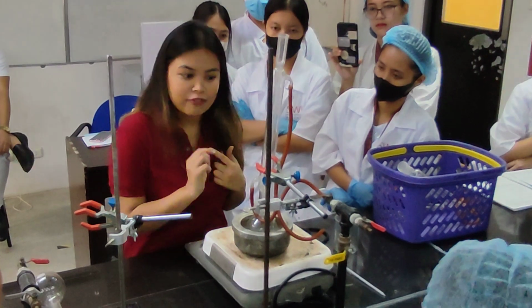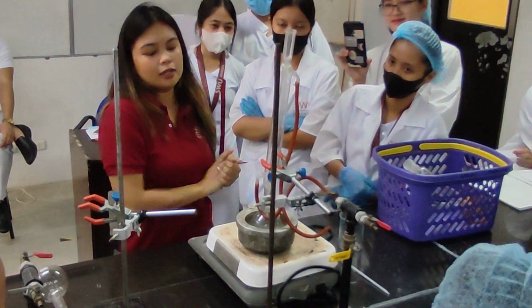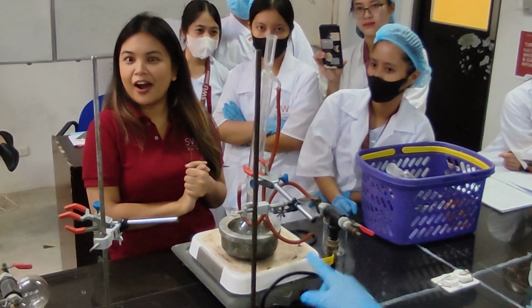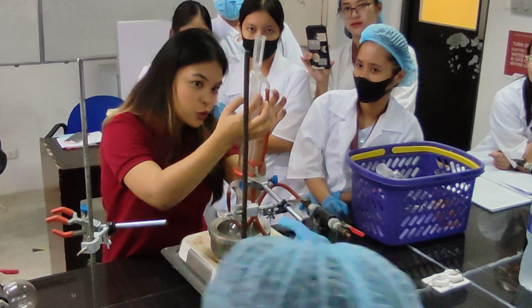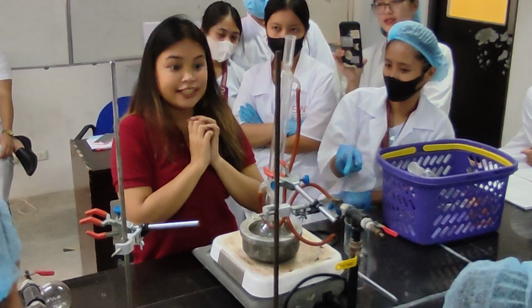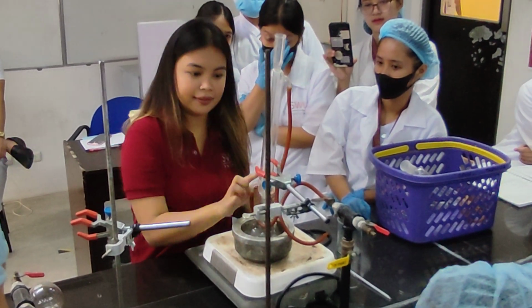It will evaporate. Where will it evaporate? In which part of the condenser? Outer or inner? Inner. Now, you have your cold water running here. What will happen?